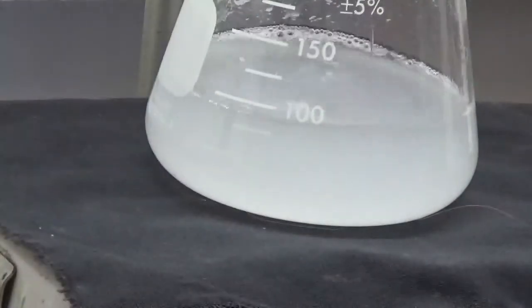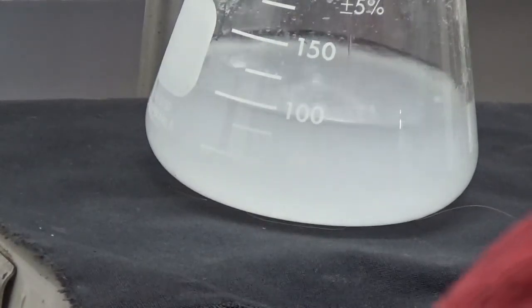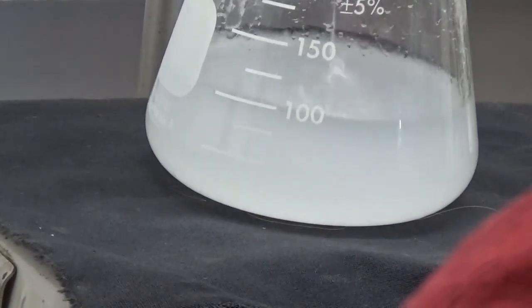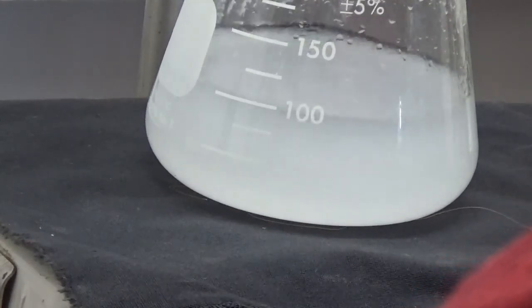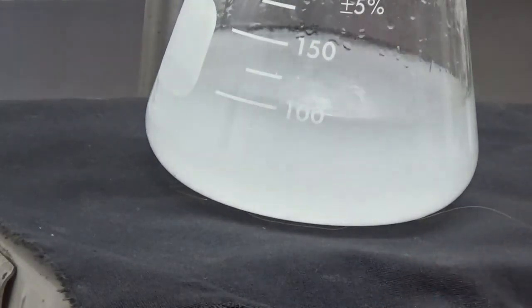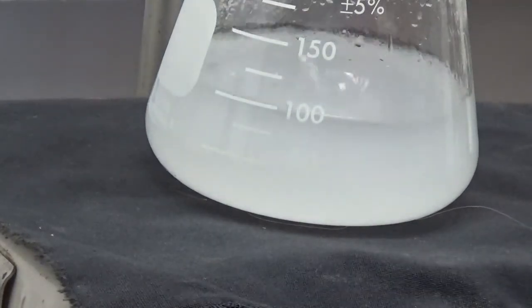Get your cloud up. Okay, I'm going to start to add acetic acid.